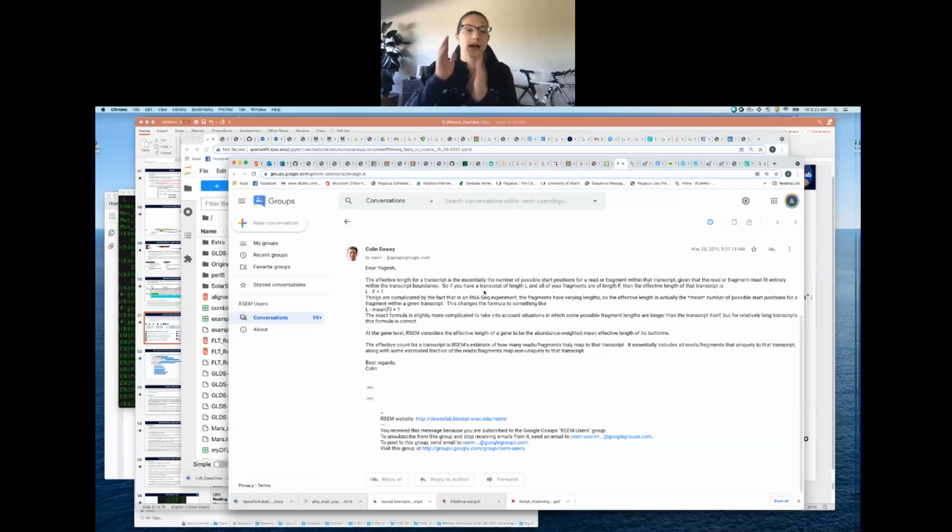That's when we chopped up our original RNA. There are copies of this particular gene and of each isoform of that gene, obviously, that's how we were able to detect it in our reads. How long our fragments are, from the start of read 1 till the end of read 2, is our fragment size, and it determines how much of a copy of each of those isoforms we can cover.